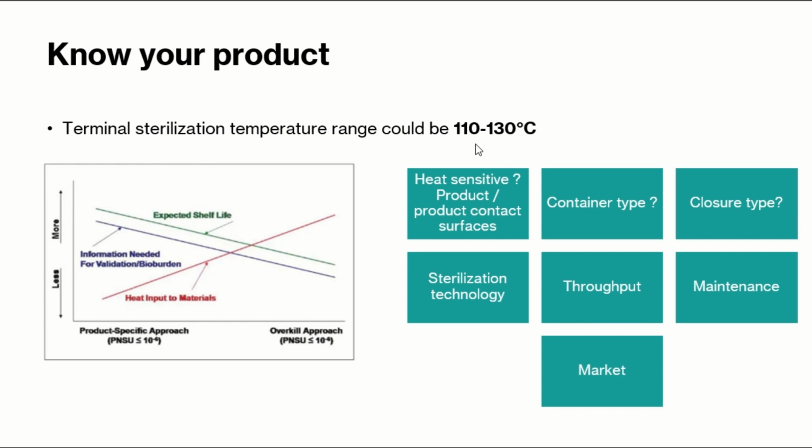So remember, when you select a product for sterilization, it must sustain the range of temperature I'm showing here. You should have certain studies in your R&D to see whether your product is sustaining high heat conditions, whether the product is generating any kind of impurities, and what else is important. Apart from that, I will explain in another slide.